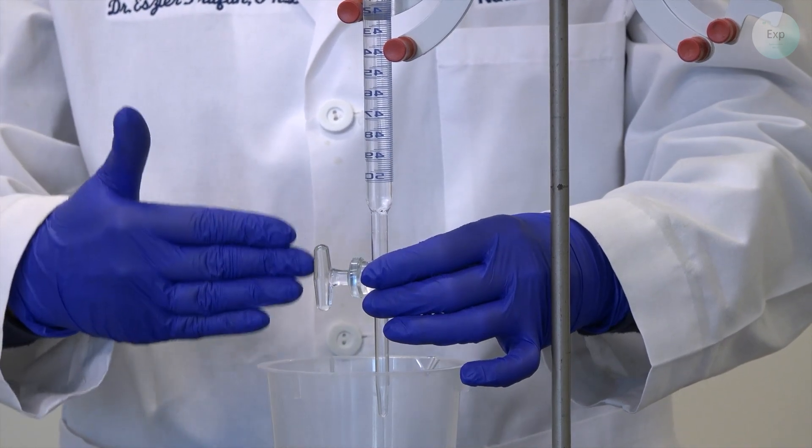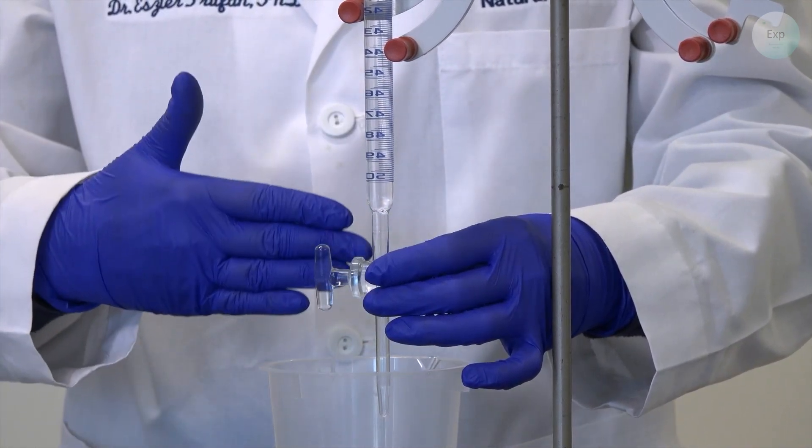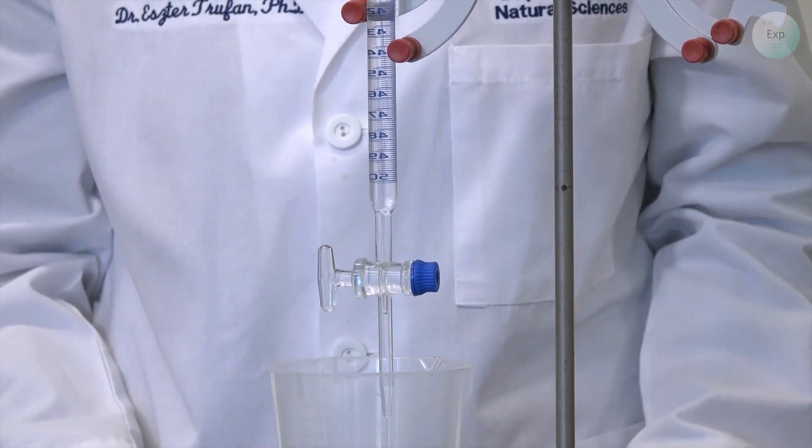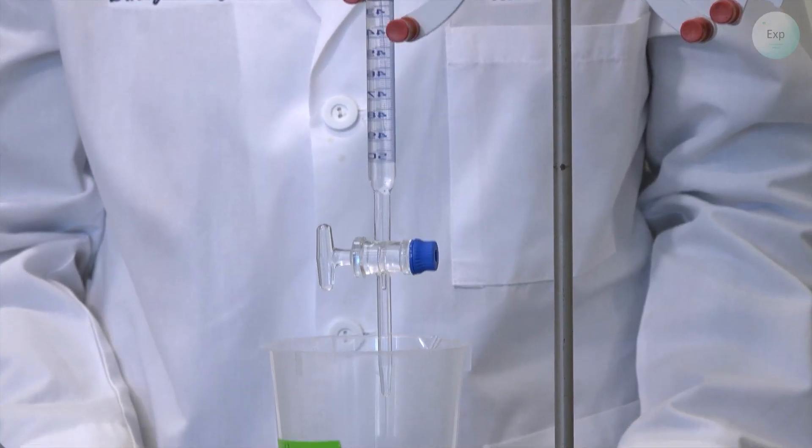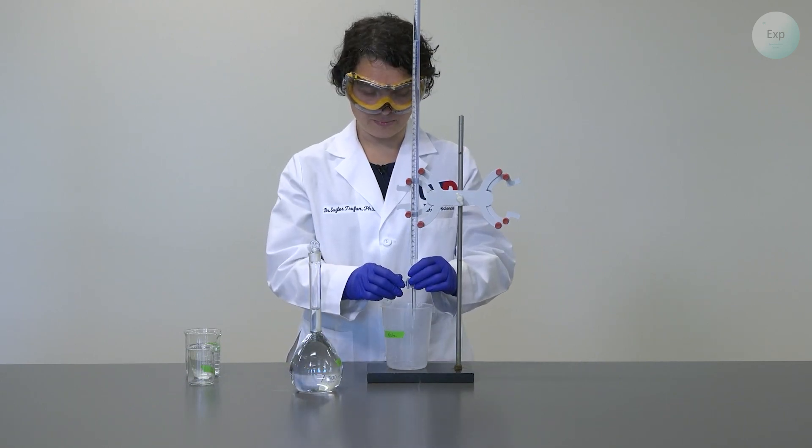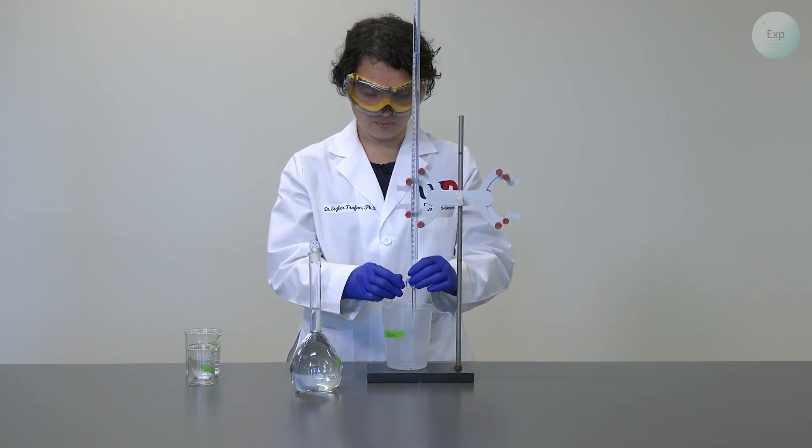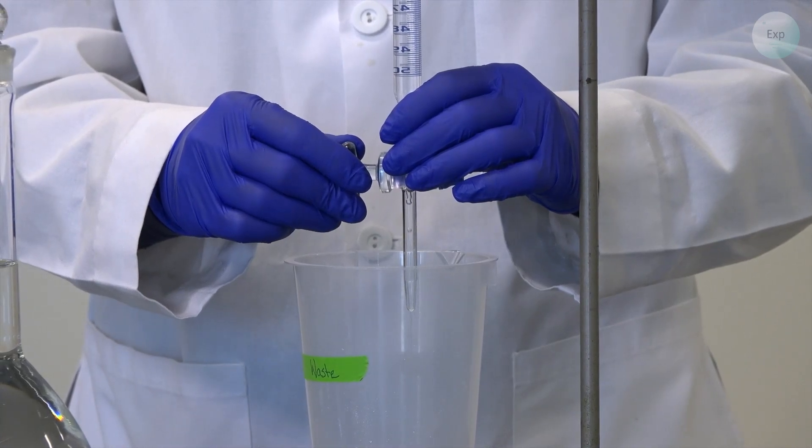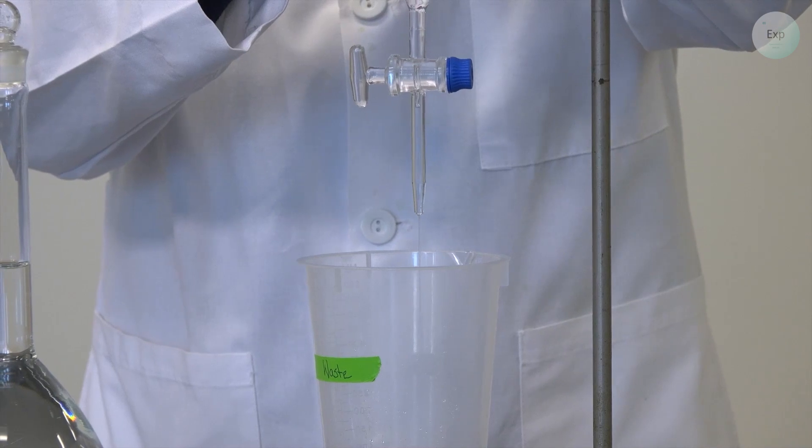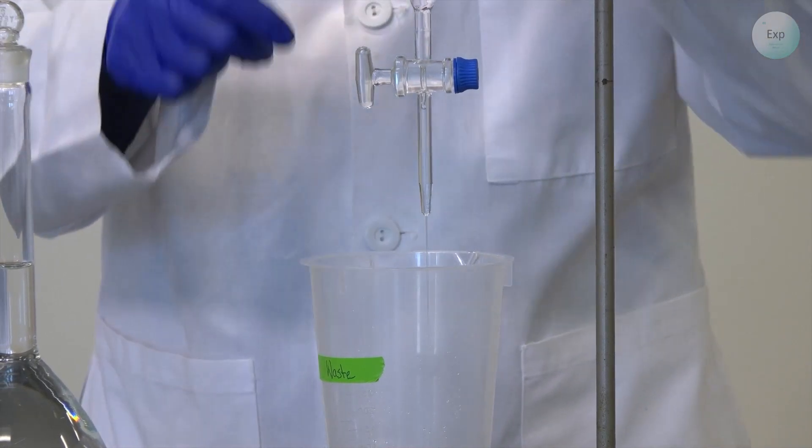At this point, the stopcock will be aligned with the orientation of the burette. And this will allow the water to flow out at its most rapid pace. Now for the different manipulations that are possible, we can slow it down a little bit.